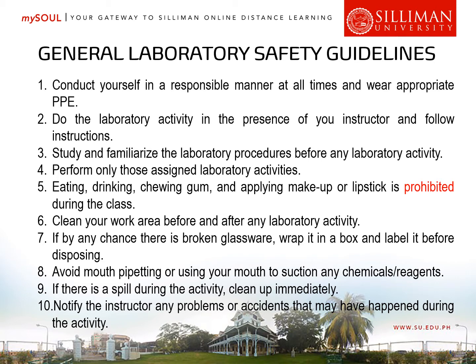Number three, study and familiarize the lab procedures before any laboratory activity. So if you are unfamiliar with the procedure, this is your chance to refresh your memory by reading what the procedure is all about, what's the principle behind the procedure, so that by the time that you're about to perform the activity or the procedure, it would be very easy for you.